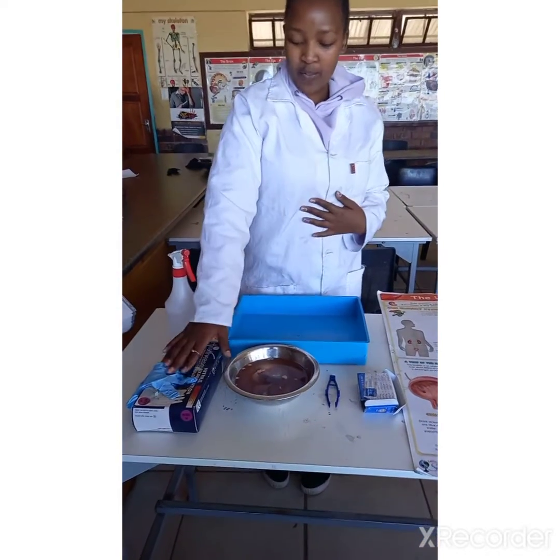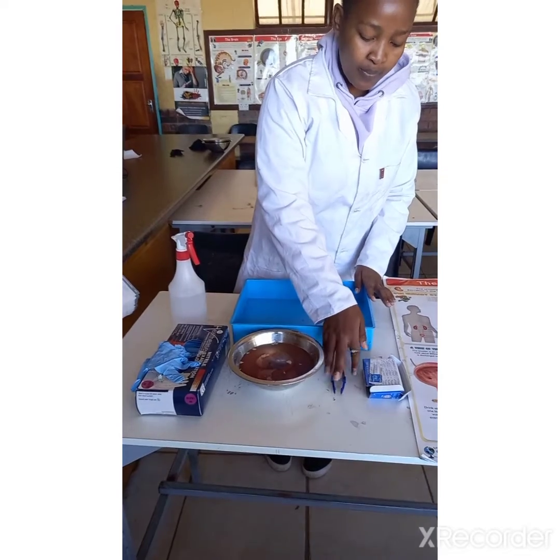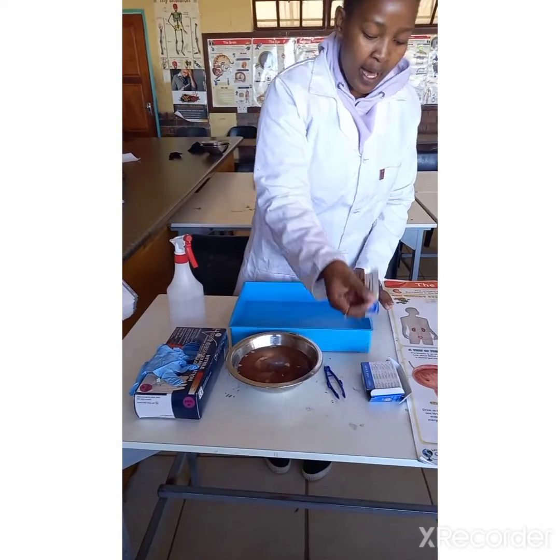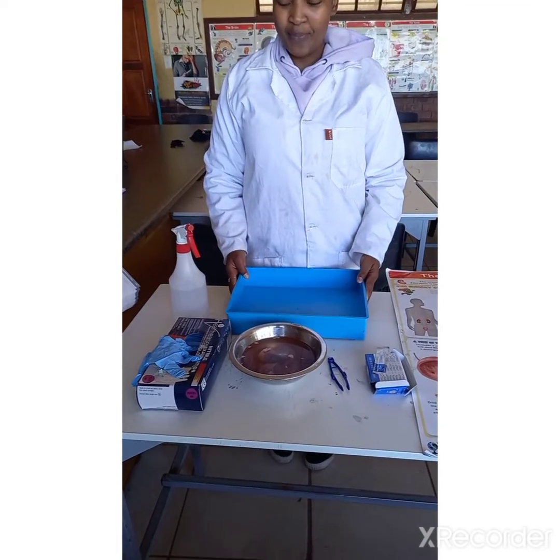Our apparatus: we have our gloves, our kidney, our tweezer, our surgical blade, and our dissection tray.